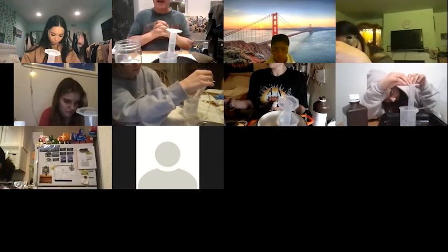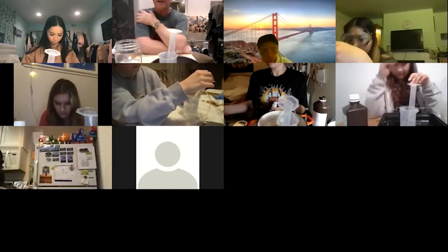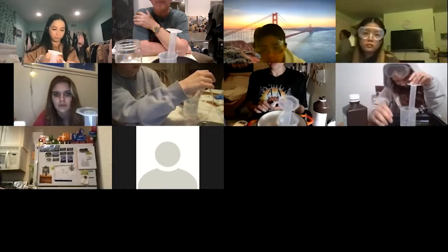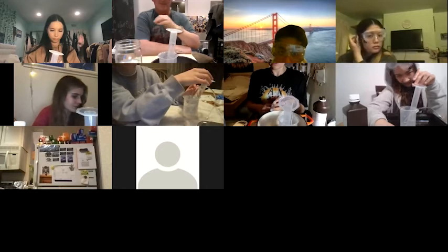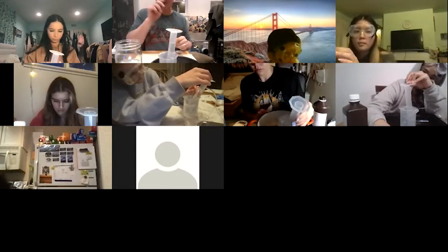What volume did you get, Anna? Did you have 1 mil of hydrogen peroxide? I'm still trying to read it right now. I can't really see. It's tricky, right? Yeah. You can lift it up as long as it doesn't break the surface of the water.